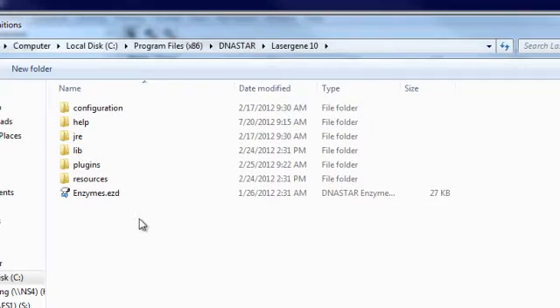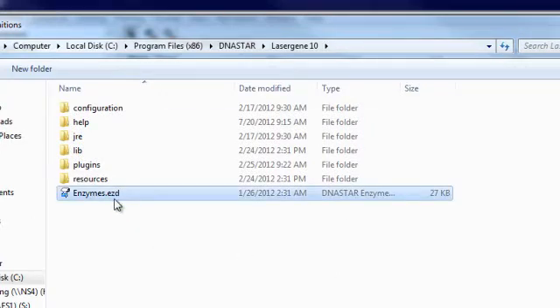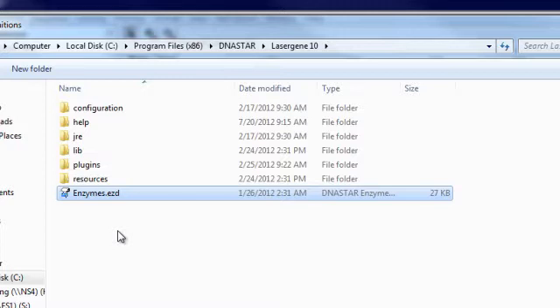So for example, if you've edited the enzyme file in an older version of LaserGene but want to merge the enzyme data from a new release, you could navigate to the enzymes.ezd file in the LaserGene 10 program directory.